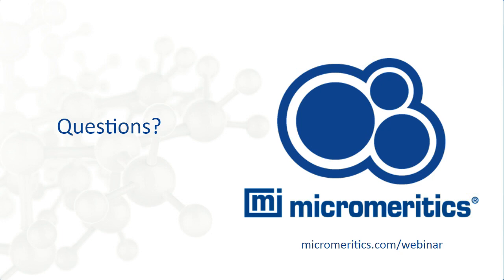Thank you. The next question gets back to maybe something really important that we often don't discuss when presenting adsorption information. Can you tell the audience what STP stands for when they look at the plots?